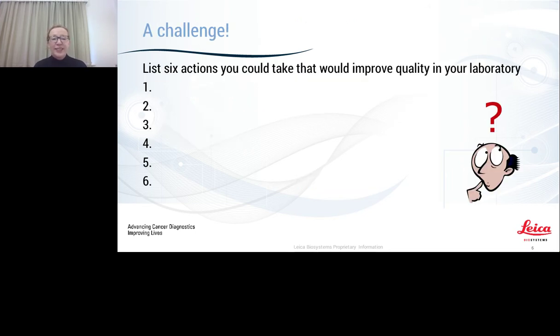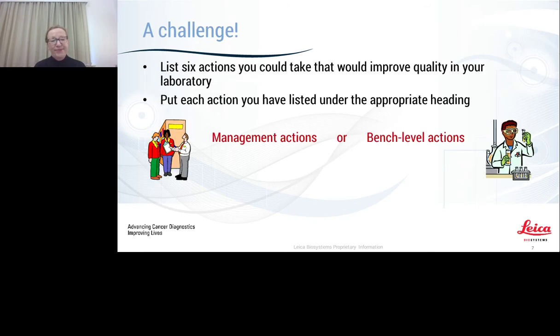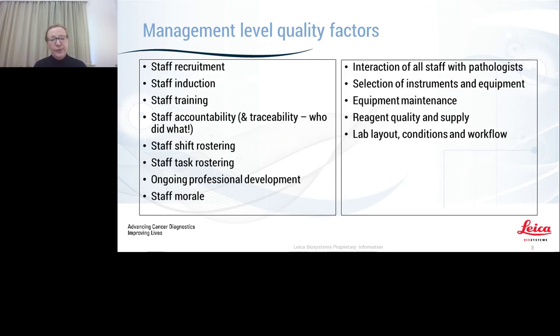So as a challenge, just think of six actions you would take to improve the quality in your laboratory. You can probably think of more than six. But what you can think about in terms of the actions are management actions and bench level actions. The majority of this talk will be on a more technical level, so we'll be talking about bench level actions, but just to go through some of the management level actions to think about.